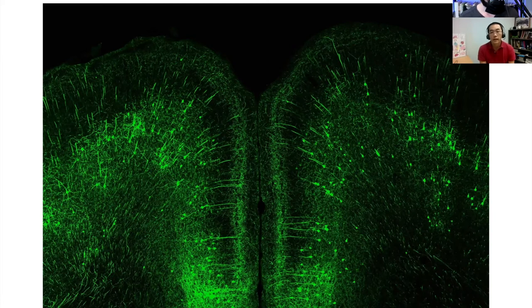That's correct. And also another thing to notice, this mouse line only labels a specific kind of brain cells. So those brain cells that are laying deeper in the frontal cortex of the animal. So that's why you see this kind of beautiful organization of these deep layer cell bodies with dendrites that radiate upwards onto the more superficial areas of the brain.